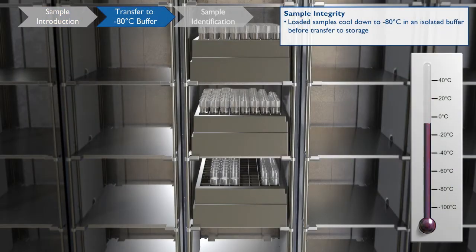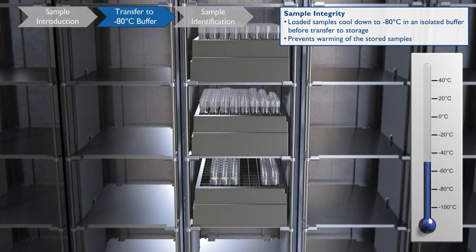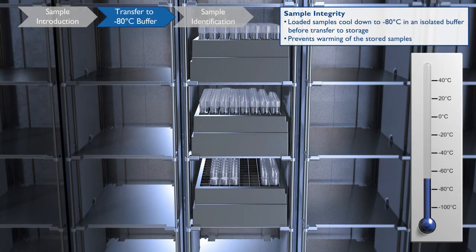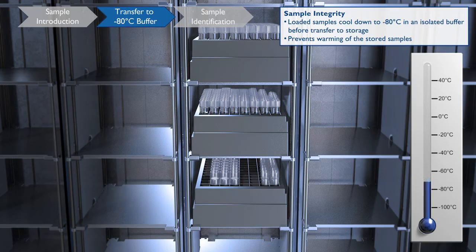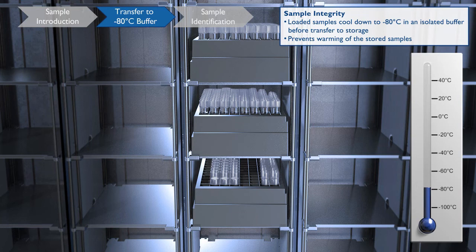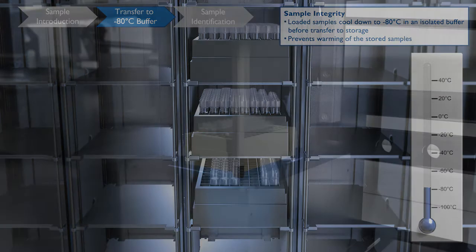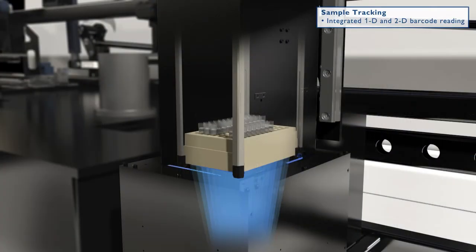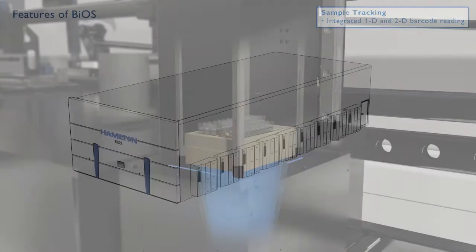Samples are isolated, then cooled to prevent warming of previously stored samples. BIOS's continuous loading feature allows you to load more racks while the first are processing. Each sample's barcode is identified to record all movements and log temperatures for each sample during its lifetime in the system.